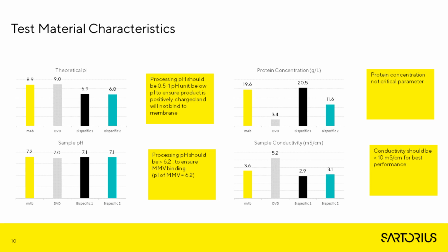The conformation of the molecule, the charge distribution on the surface of it can also influence whether or not it's going to bind to the membrane. Anyway, looking at this, it's still kind of a red flag to have the PI value lower than the pH.